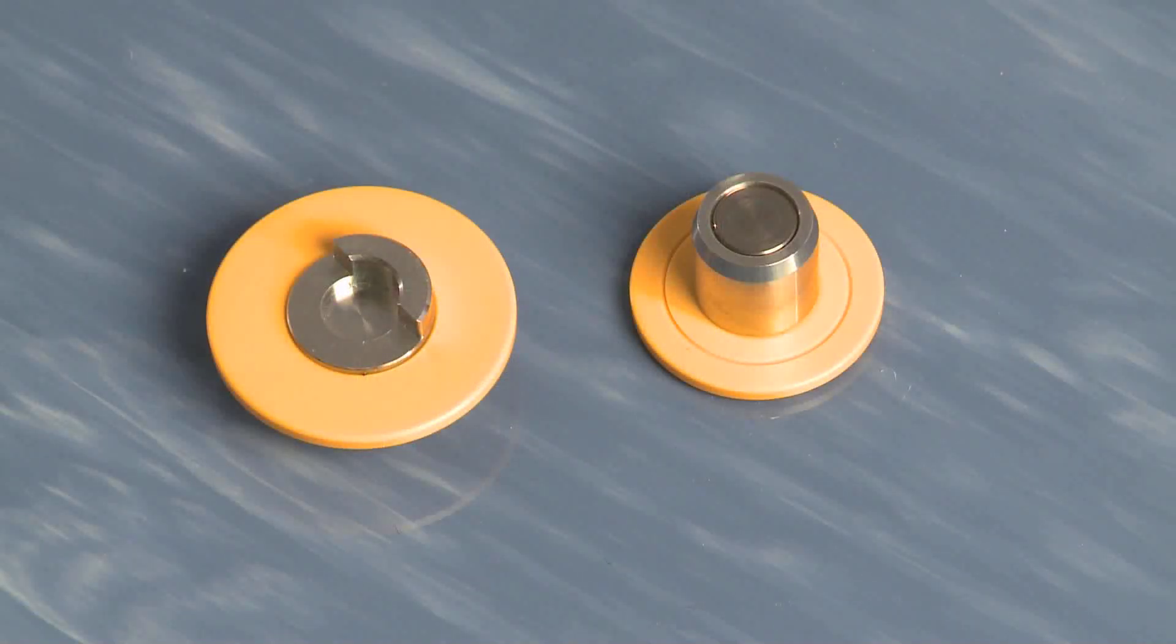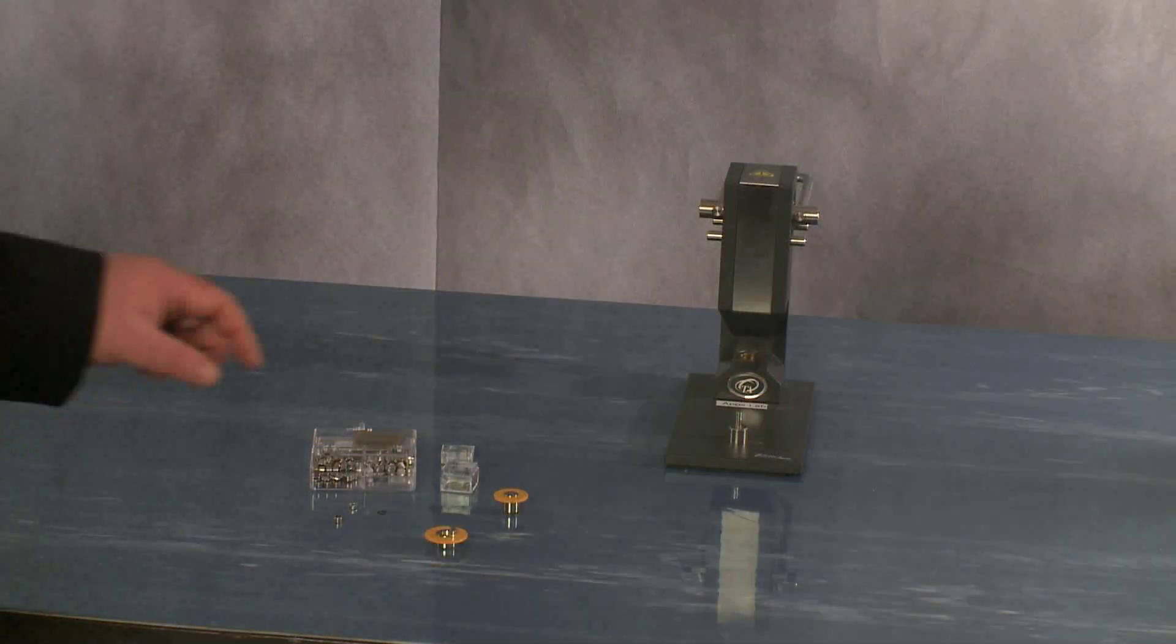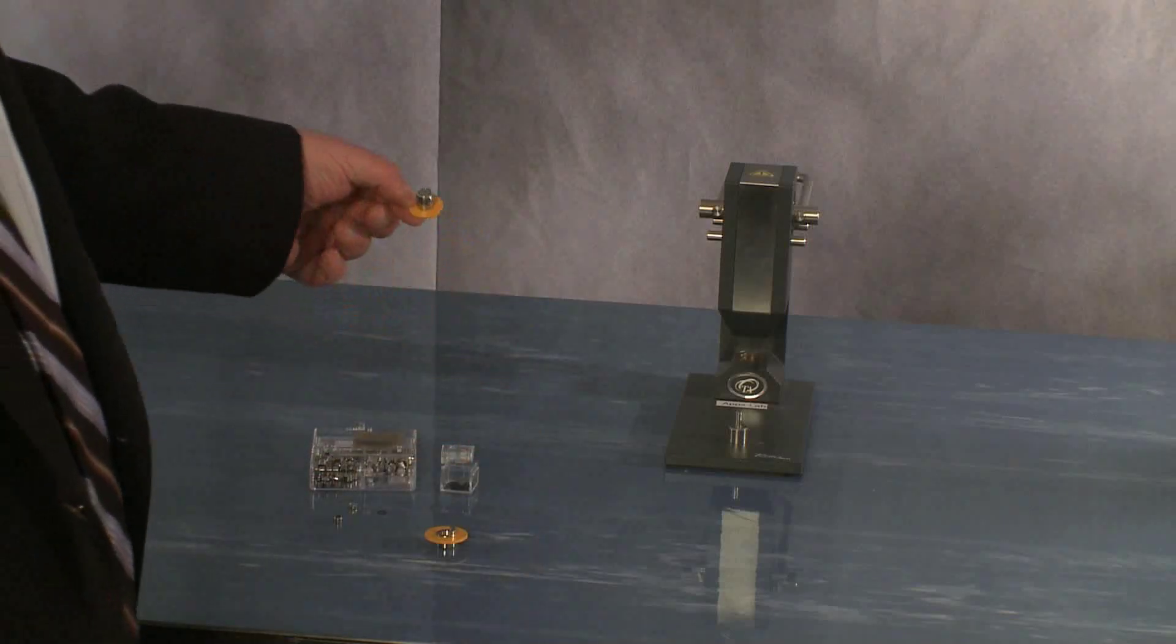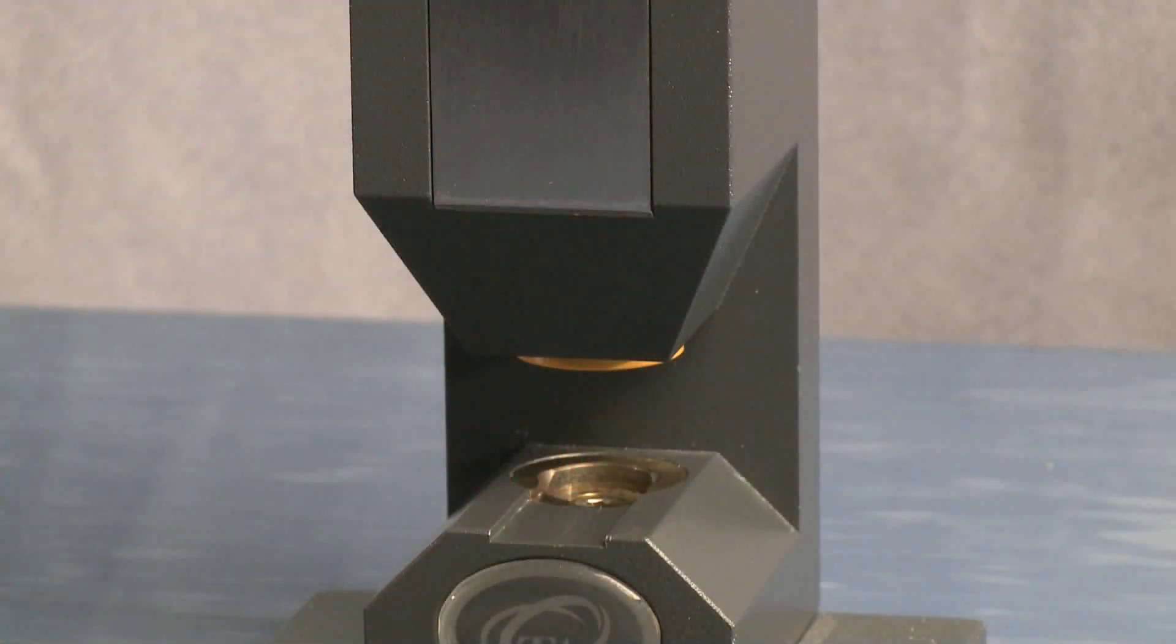The die set that we use is the T0 die set and it's a yellow die set and it goes in the T0 press. The sealing die just simply fits underneath and is held in with a magnet.